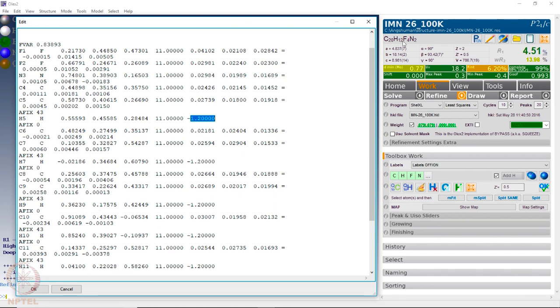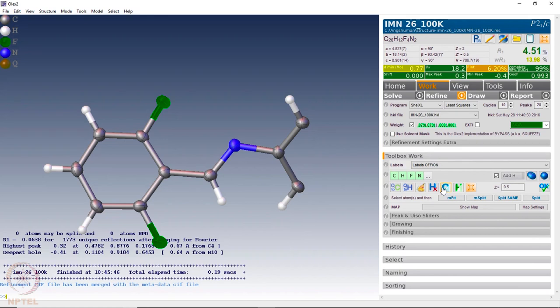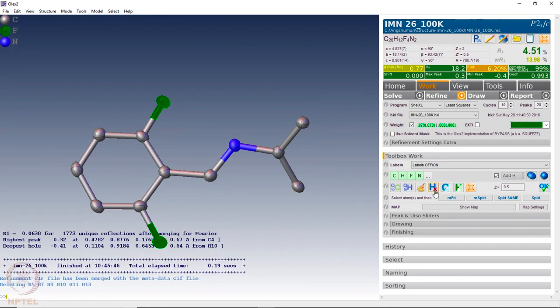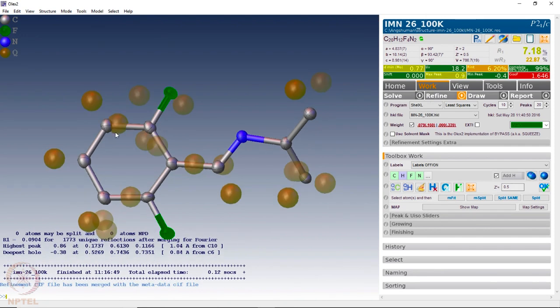Let us see what happens if we first remove these hydrogens by typing 'H cross' — that removes all the hydrogens — and then do 10 cycles of refinement, which performs least squares refinement. What it does is take the structure we have given and calculate the structure factors for every hkl, then compare the calculated structure factors with the experimentally observed structure factor amplitudes.